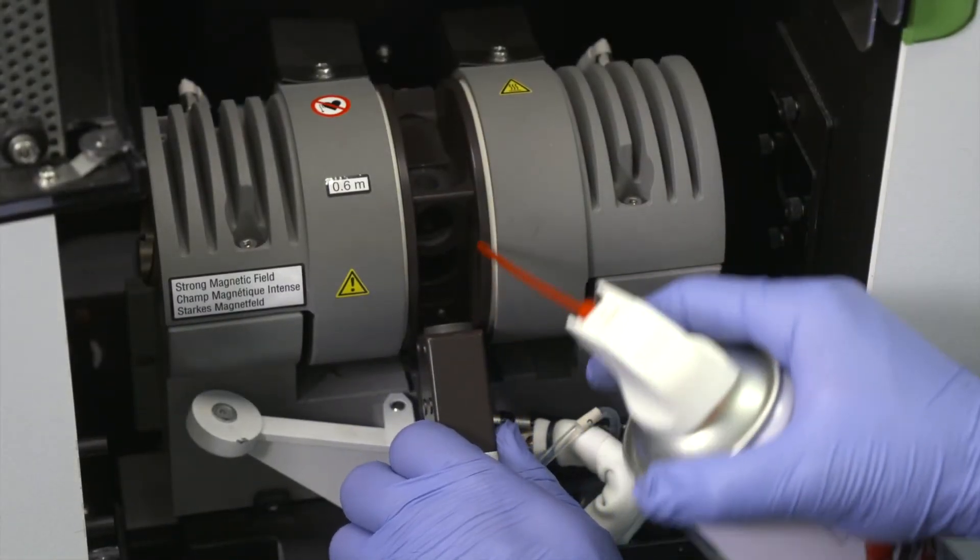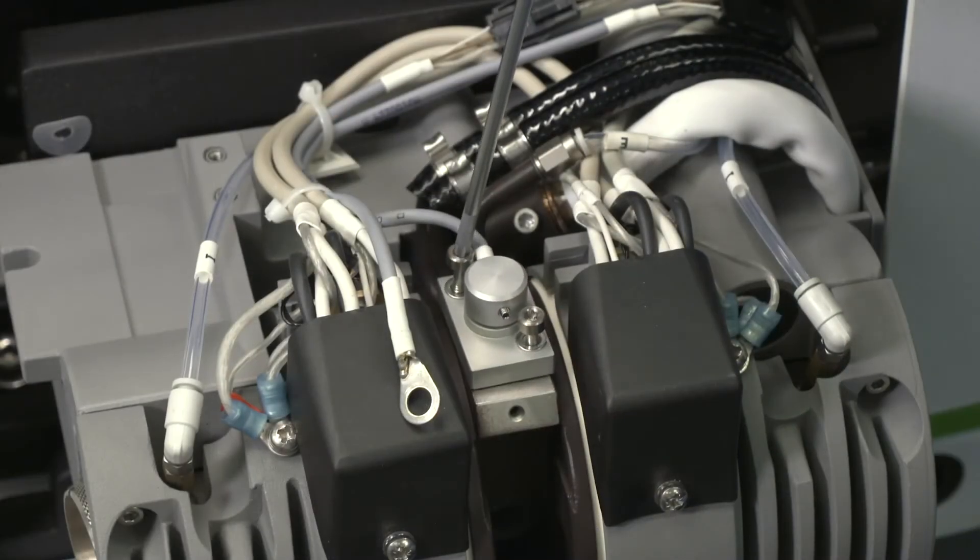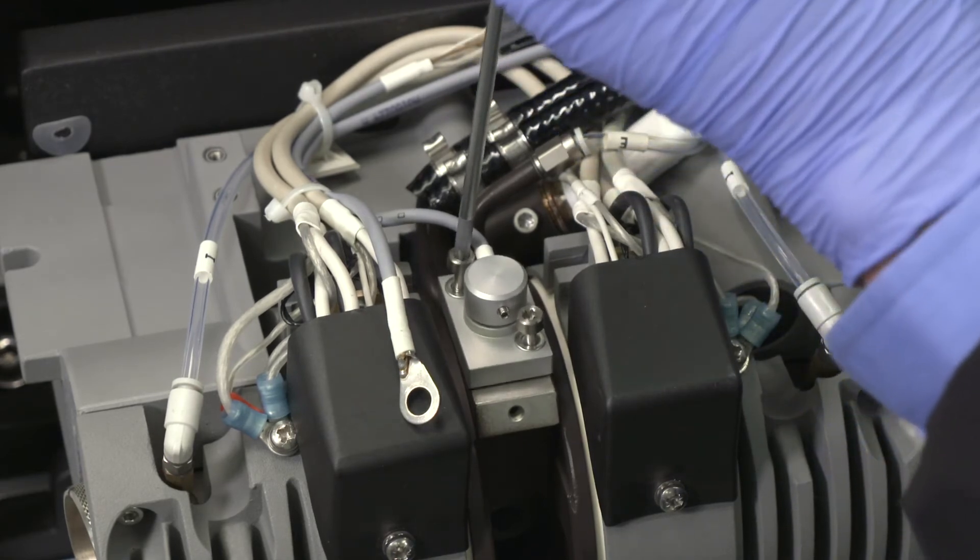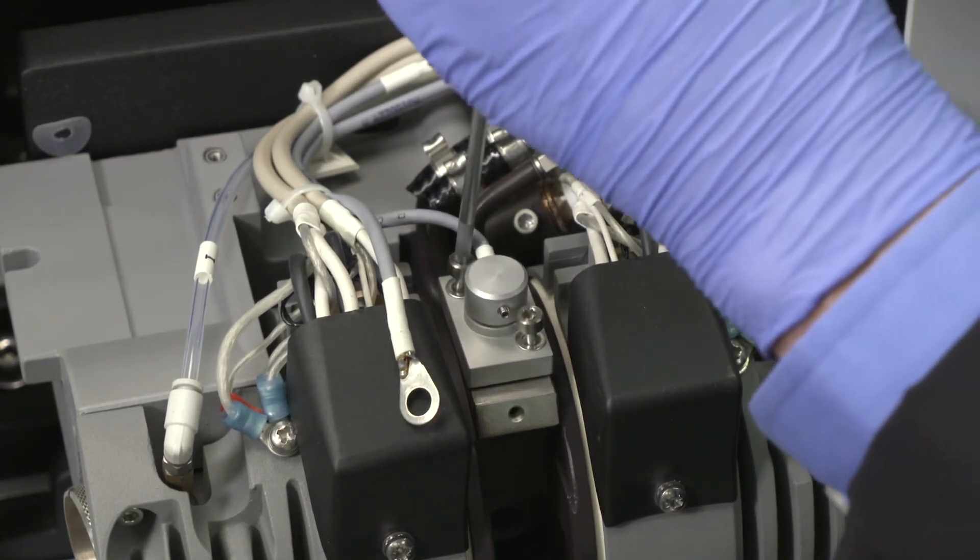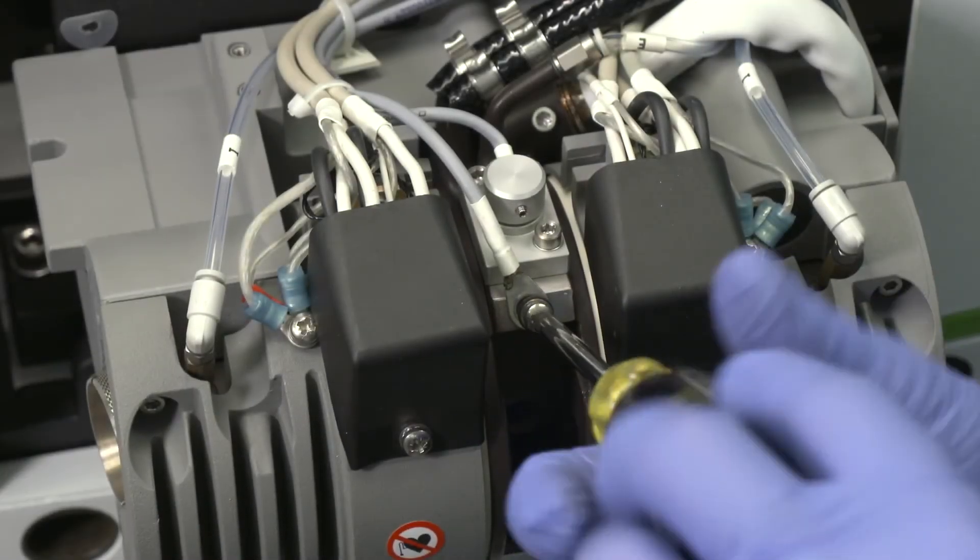Blow out any graphite particles with compressed air. Push the optical sensor into the rear contact housing. Make sure that you do not damage the O-ring. Tighten the two screws to secure the optical sensor to the rear contact housing and reattach the temperature sensor.